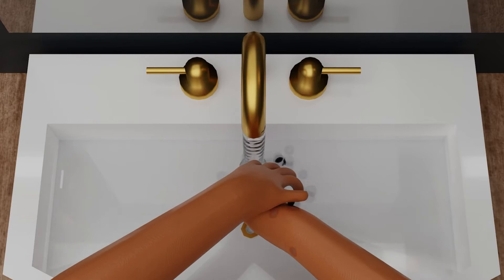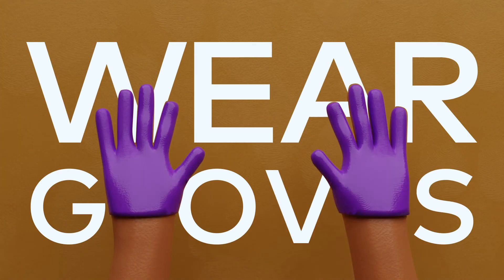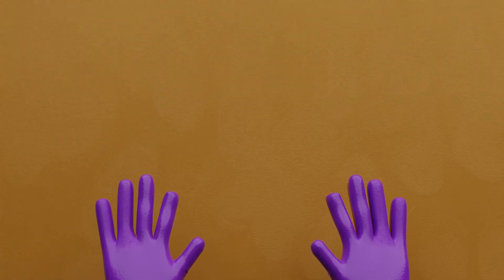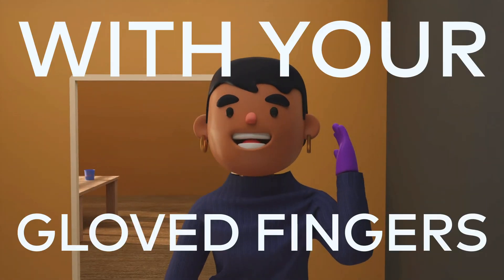Wash your hands before and after manipulating your experiment or the hardware. Wear gloves even when cleaning your station or handling the kit contents. After you put on your gloves, be aware of what you touch. Try not to touch your face or scratch itches with your gloved fingers.